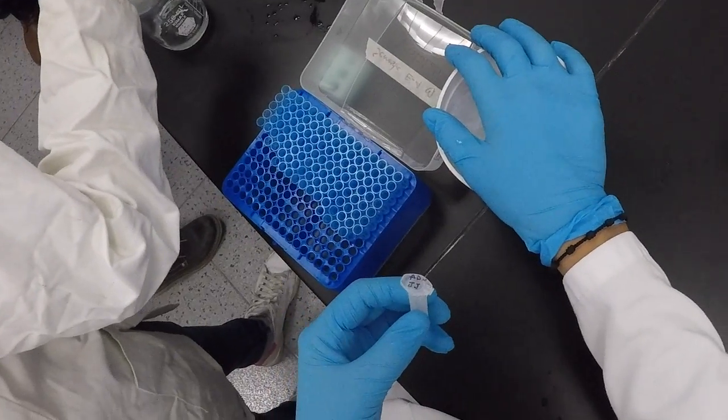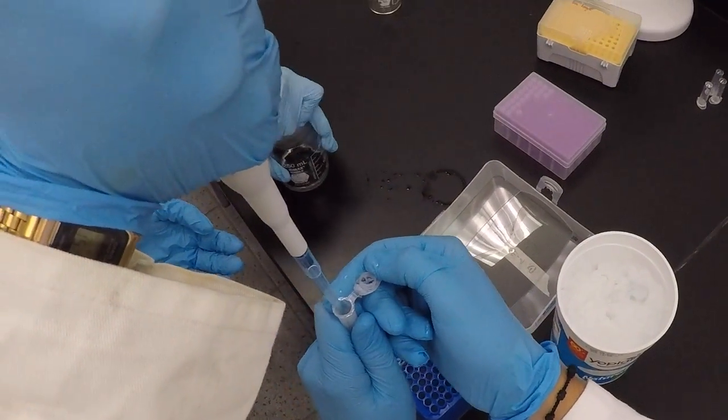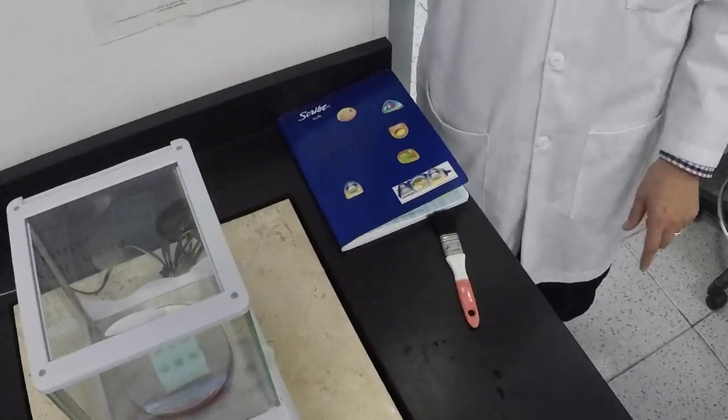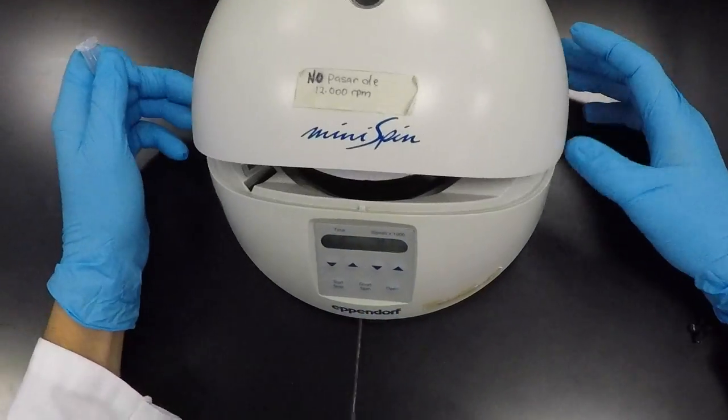Place on ice and add 3 volumes of absolute ethanol. This equates to approximately 330 microliters. Then centrifuge for 3 minutes at 8700 rpm.